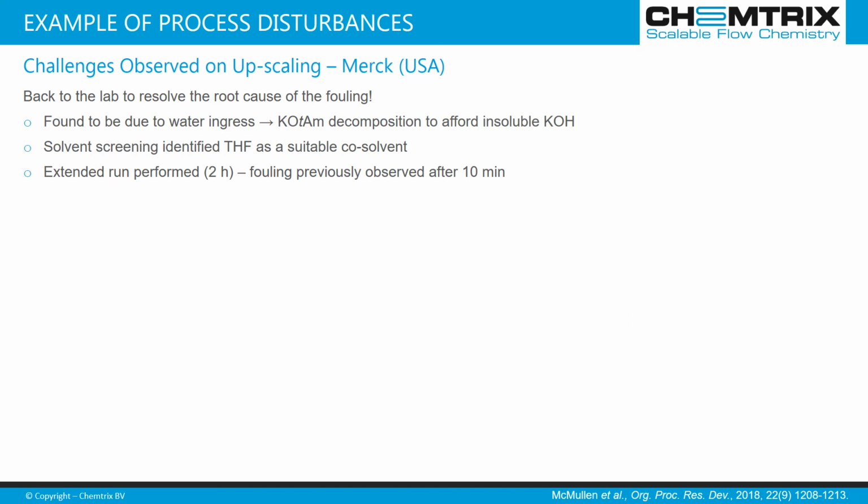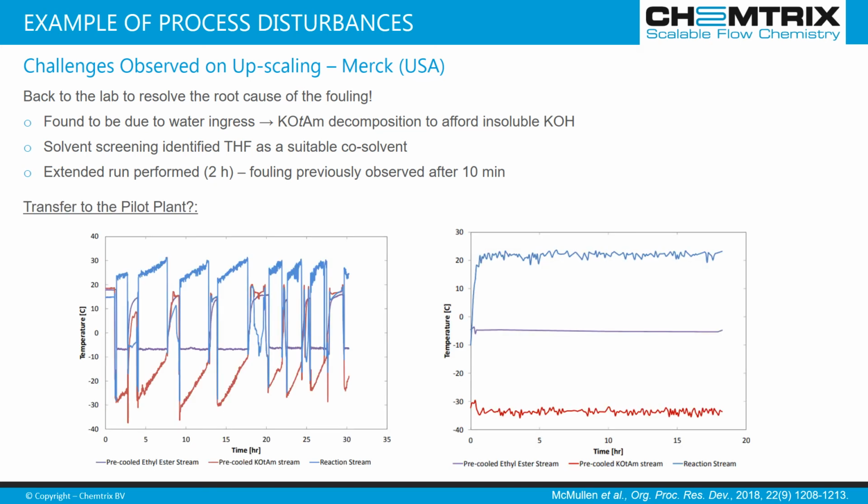So they went back to the lab and they looked into the root cause, and they found that water ingress in the base was leading to decomposition. Insoluble KOH was being generated, and this was building up. So by screening solvents, adding THF as a suitable co-solvent, they were able to do an extended run for 2 hours. And what you can see on the right is an incredibly different picture to the original trip to the pilot plant. So what you can see is that previously fouling occurred after 10 minutes, and in the new setup an extended run of 2 hours was possible.